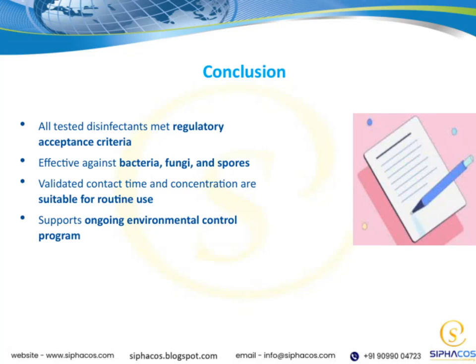In conclusion, I want to highlight that all the disinfectants we tested met the regulatory acceptance criteria, which is really encouraging. This means they are reliable options for our disinfection needs. They are effective not just against bacteria, but also fungi and spores, which covers a broad spectrum of potential contaminants.